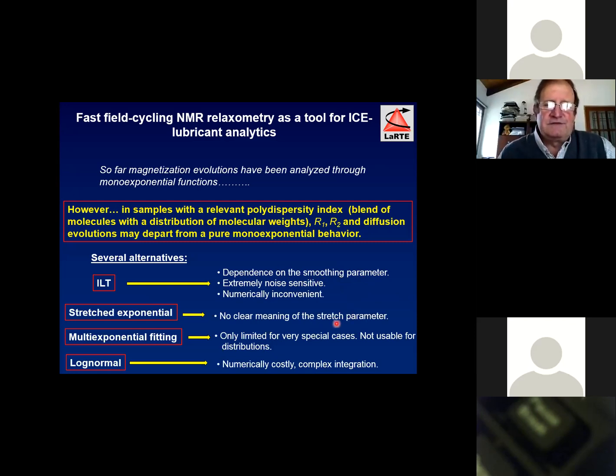Okay, and so on. The stretching parameter is sometimes difficult to interpret. Multi-exponential fitting you cannot do if you have several exponential decays or a distribution. It's not useful at all. And log normal has some numerically complex integrations in between.